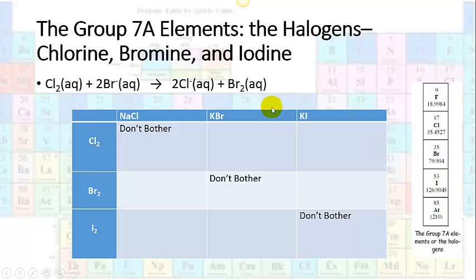So you will have solutions of these halogens, in their elemental form, dissolved in water. And you'll be recording what those look like dissolved in water. You'll also be recording what these look like and what colors they are dissolved in hexane. And you're going to use that in your interpretation of your reactions then.